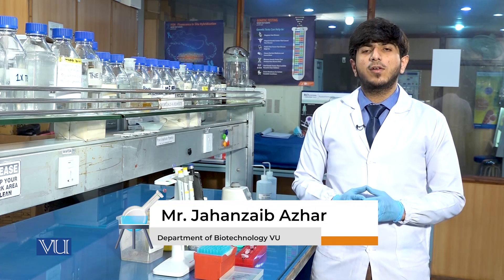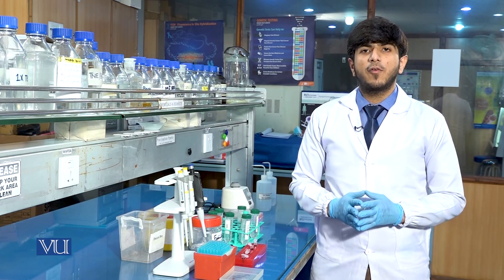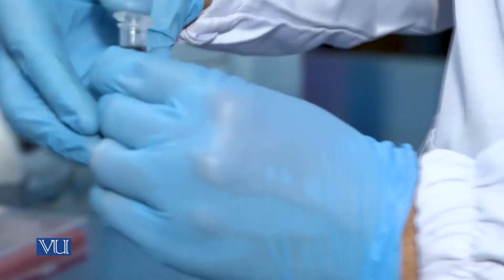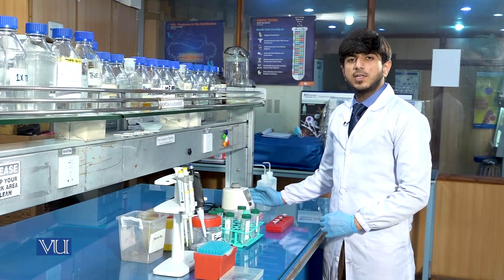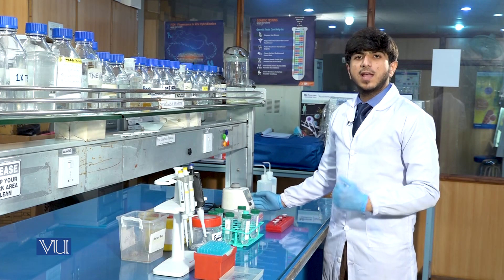After the addition of 1000 microlitres of lysis buffer, we will vortex the sample for 5 minutes. This is a vortex machine and we will now vortex the sample to homogenize the mixture.